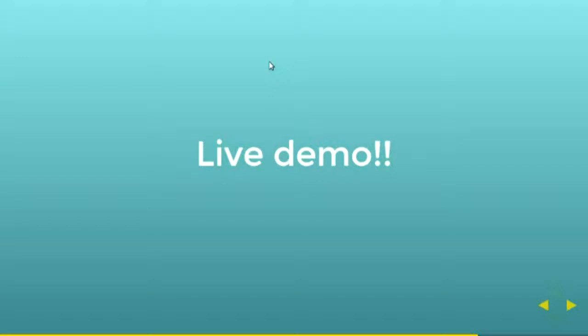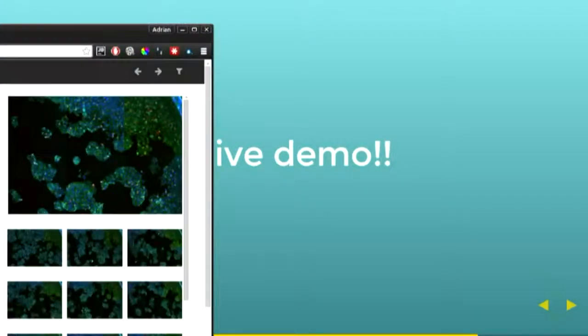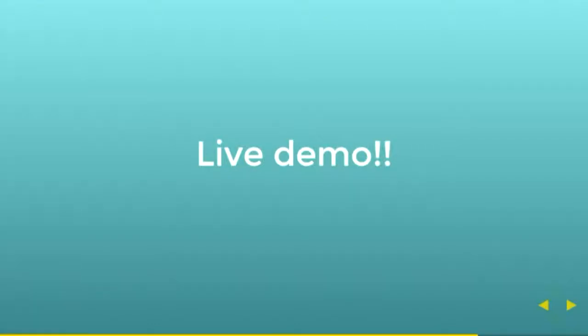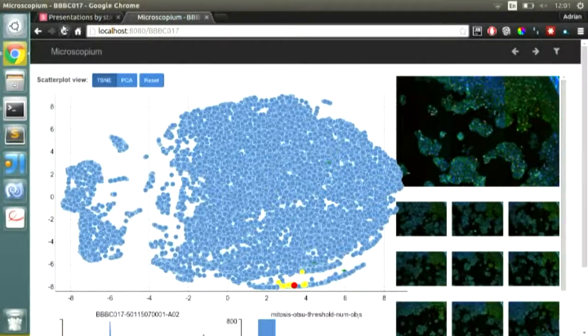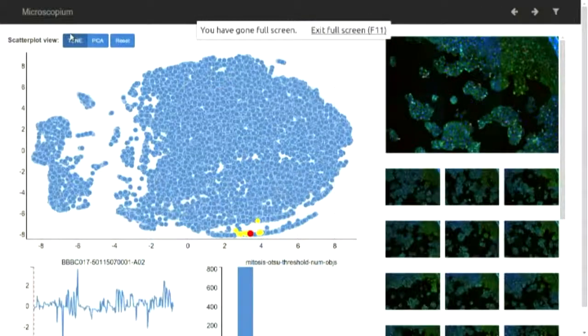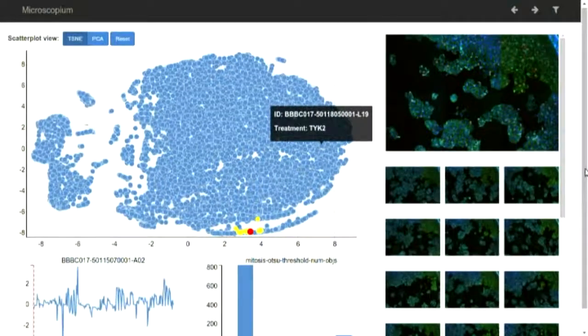I'll just provide a live demo of Microscopium in action. This should give you a better idea of what I mean. Cool, the data set that we're looking at here is a screen that was done a few years ago on a collection of HT29 colon cancer cells where 1,000 different genes were treated using short hairpin RNA.